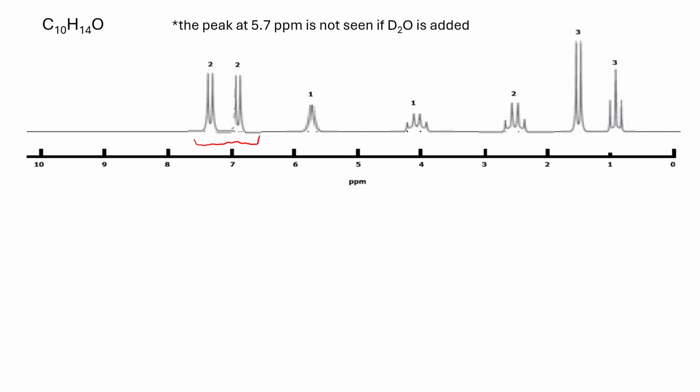Okay, so let's just note that down, that this confirms that we have an aromatic ring. Because we have a hydrogen attached to an aromatic ring, shifts.